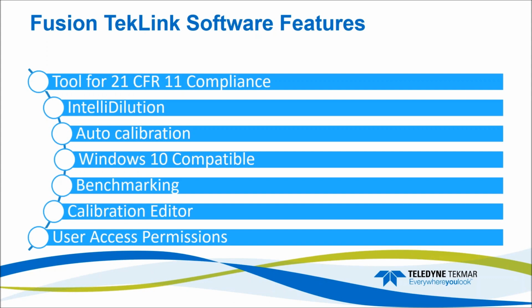It will do all these kind of things to help you troubleshoot in case there is an issue. There's also a calibration editor, so you can make up several different calibrations with different methods in the same schedule. So let's say you run really clean samples, but you also occasionally get dirty samples from, you know, a certain customer. You can have two different calibration curves in one schedule, and you can identify which calibration curve you want it to use.